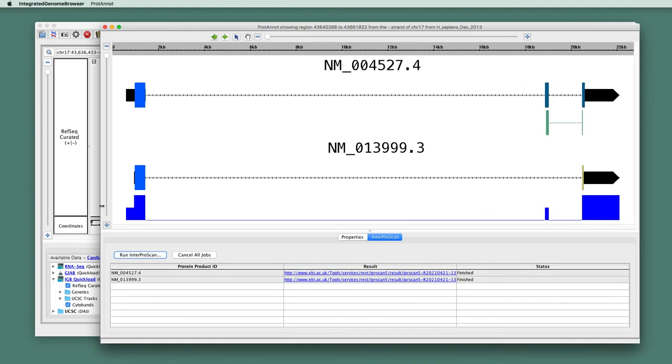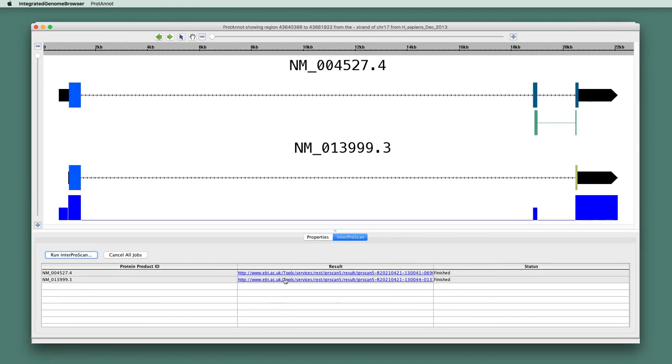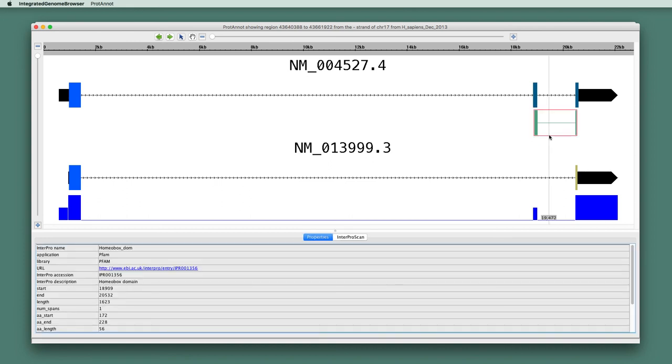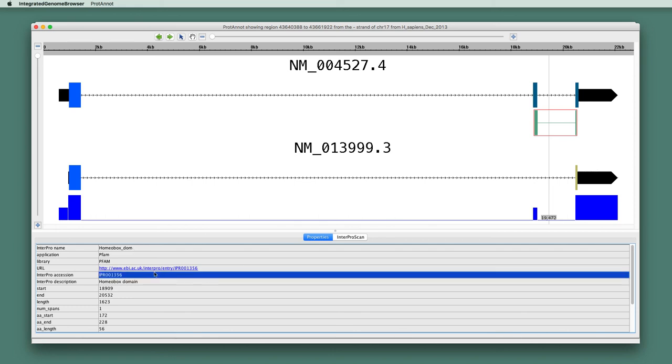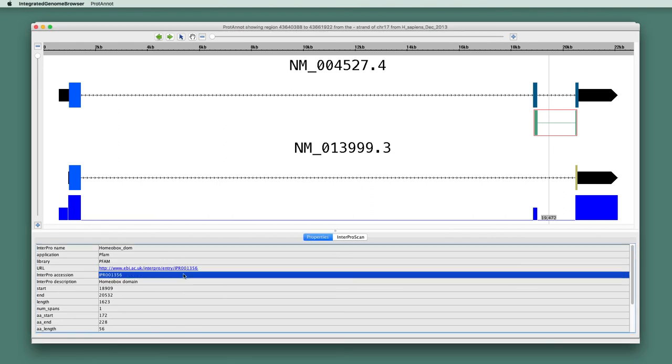So ProtoNote has finished the search. And if we would like to see the raw data for the search result, we can click on these links, and a web browser will open showing us the results in text format that we got from InterProScan. And notice that in the display, there's now a new item that represents a match to a homeobox domain containing motif or a homeobox domain.